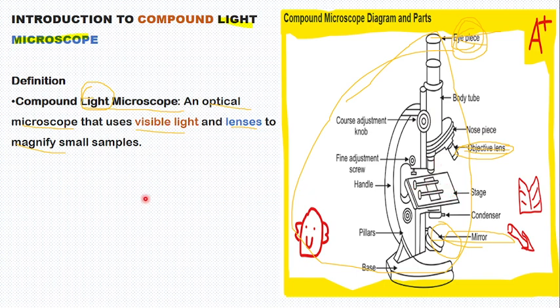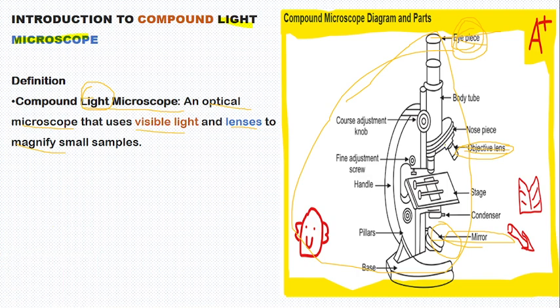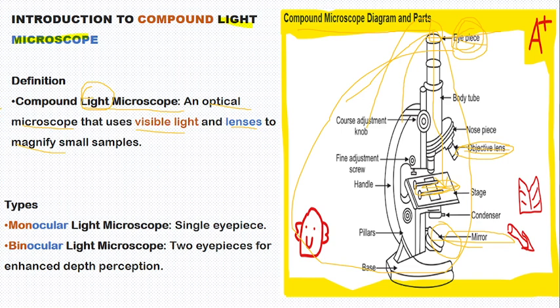This is where you put the slides, and your eyes are here observing what is on the slide. This is what you call compound microscopy.